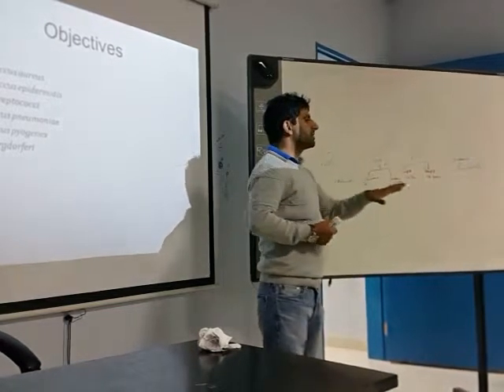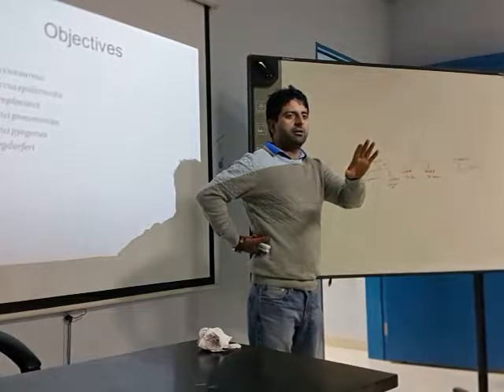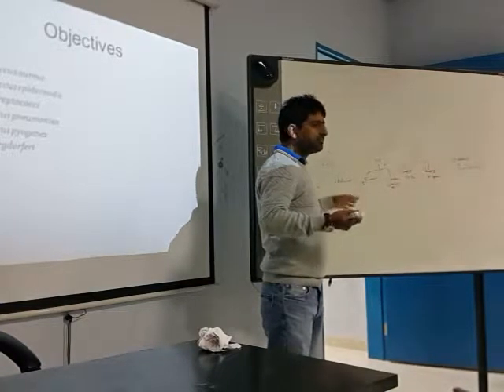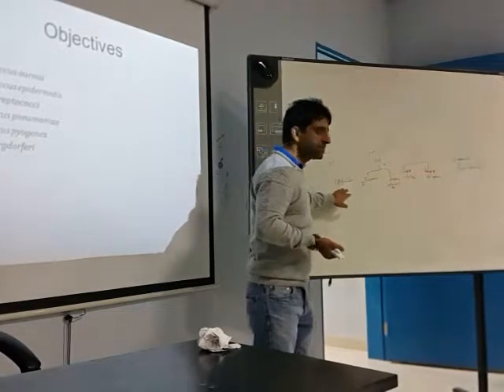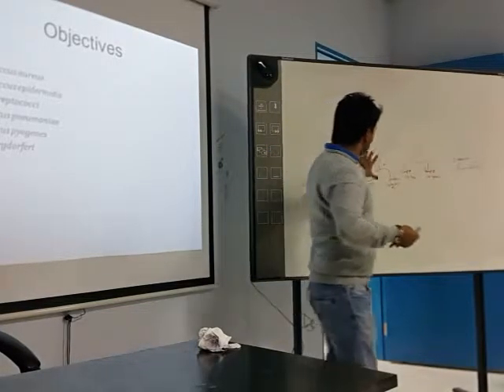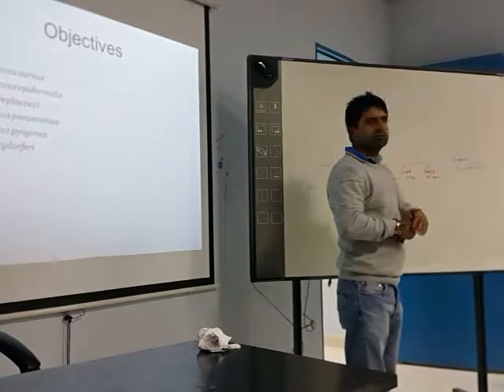You are suspecting the patient having the infection of Staphylococcus. You do not know whether it is aureus or epidermidis, okay? Same family, but you need to differentiate them, whether the patient is having the aureus infection or the epidermidis infection. Fine? In the next, you are finding the patient having the infection of Streptococcus, okay?